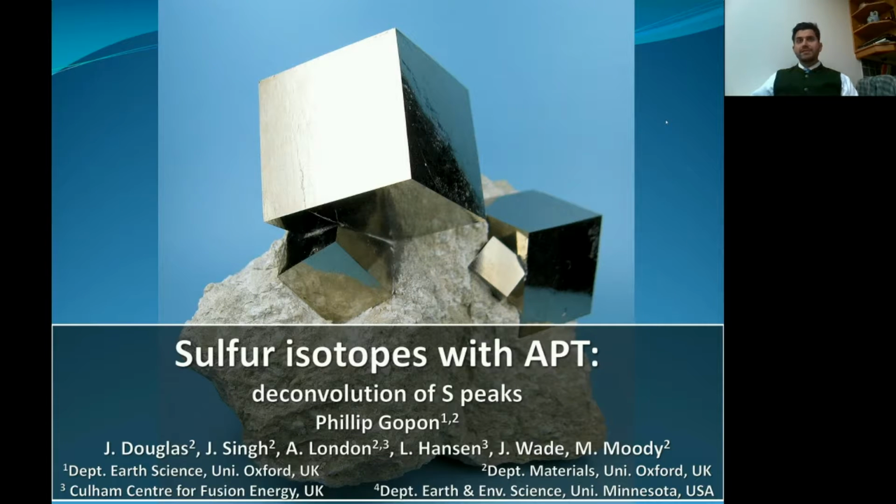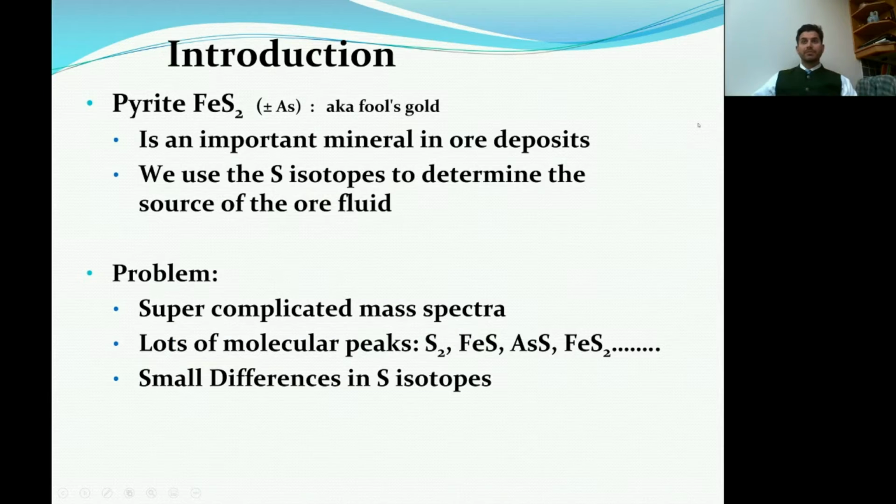Alright, I'm Phil, and we'll be talking about sulfur isotopes with the atom probe in the script that we wrote to do that. Mostly I'll be talking about pyrite, which is an important mineral in ore deposits. We use the sulfur isotopes to determine the source of the ore fluids, among other things.